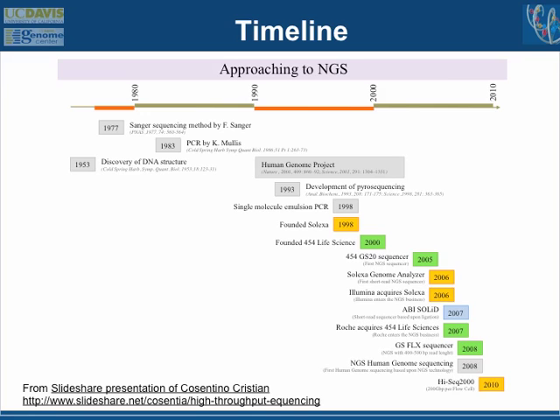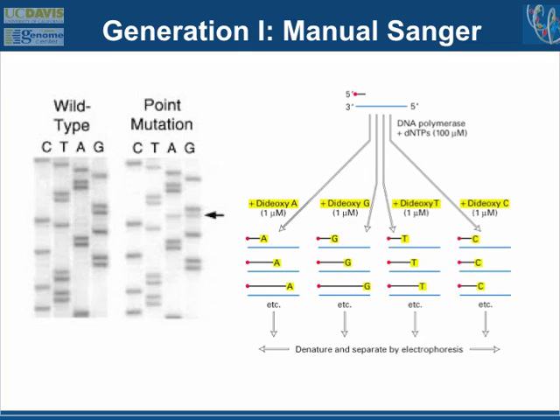And now in the last year or two, there have been these third, fourth, fifth generation DNA sequencing technologies, and I'll talk about these a little bit right at the end. What I'm going to focus on mostly is what are generally called the second generation sequencing technologies, although already, really, I'll just get to the punchline. Already, the 454 and ABI SOLiD technologies, you can just throw them in the trash compared to the revolutions that have happened with the Illumina sequencing method. And then Illumina has won the battle, in essence, for these second generation sequencers. And now the question is, is one of the third generation sequencing systems going to replace the Illumina method?